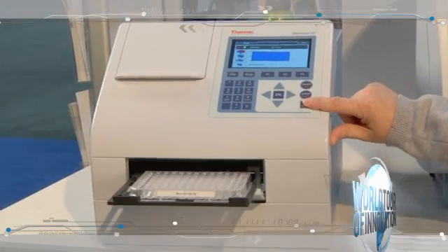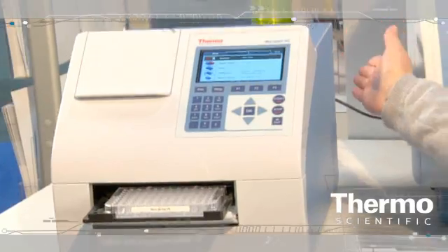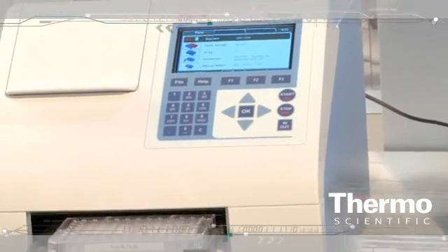The system has onboard programming, which allows you quick access. You can also save your data directly to a USB memory stick for true standalone applications. Or you can run the system with our ScanIt software on a PC and have more data control and data analysis opportunities available to you.